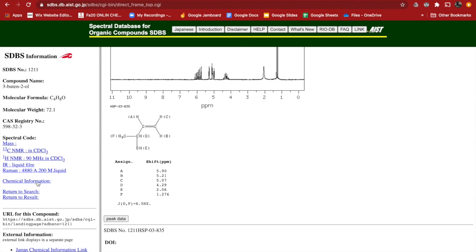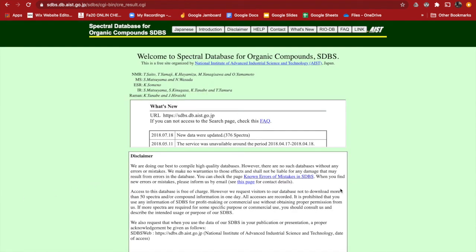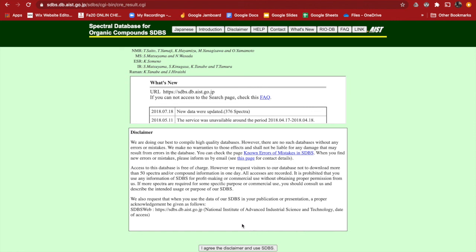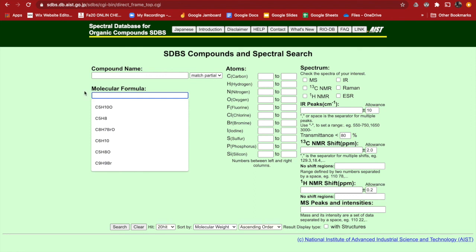All right, so that was pretty good. I could return to results and continue on, but I'll let you guys jump in. Oh, and I was hoping this would happen. If you're at a particular spectrum like we just were for a little while, a pretty short amount of time, like a couple minutes, it kicks you back out to this disclaimer. They really want you to read this. I haven't, but I just agree again. And then it's kind of annoying, sometimes you have to re-input your value, but not that big a deal. And hey, beggars can't be choosers. This is all free.